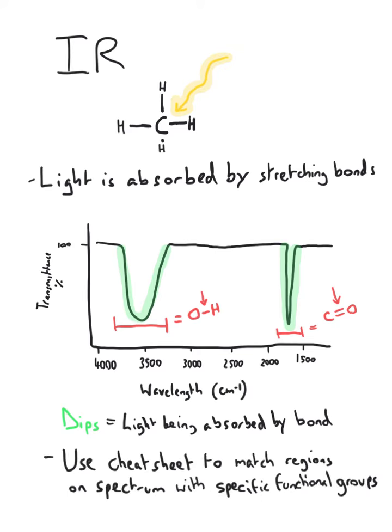Either way, the more you see these, the more you'll start recognizing patterns, but if not, use a cheat sheet and recognize what functional groups are present.